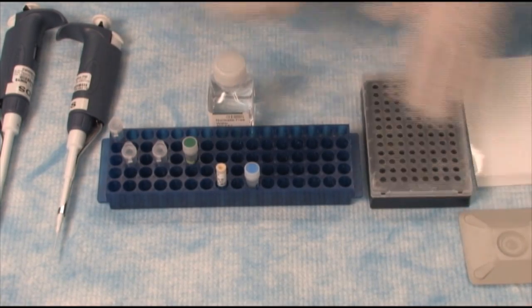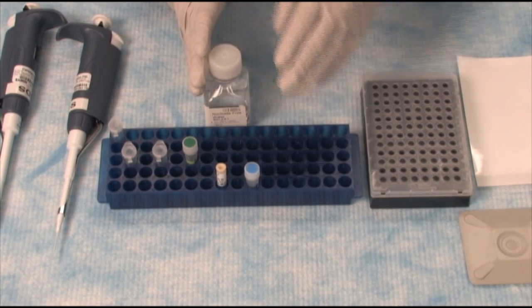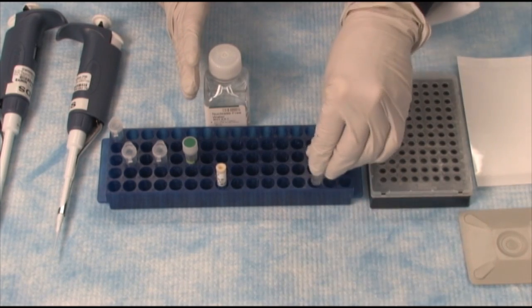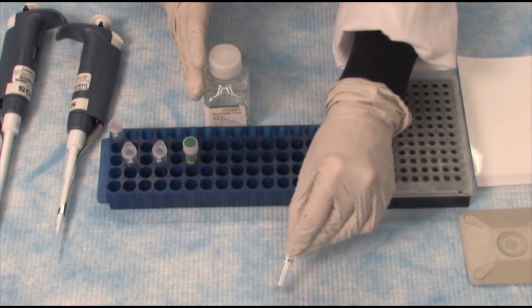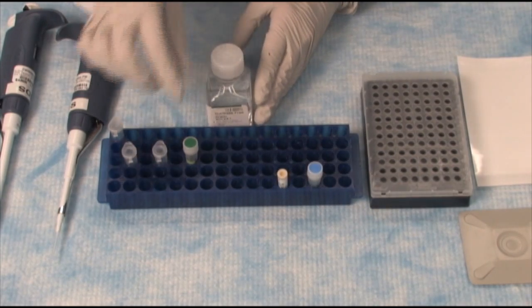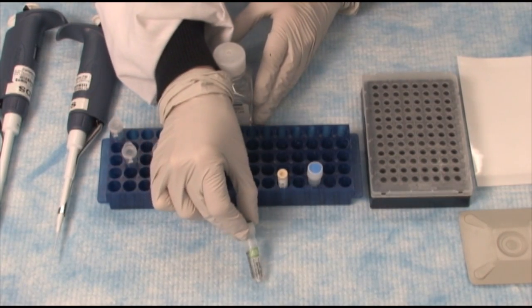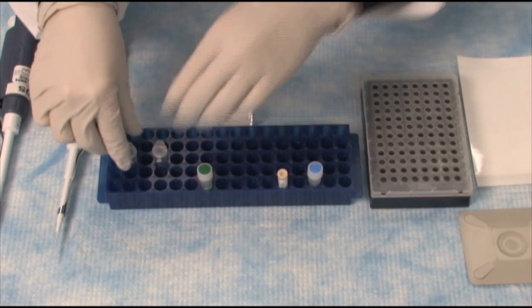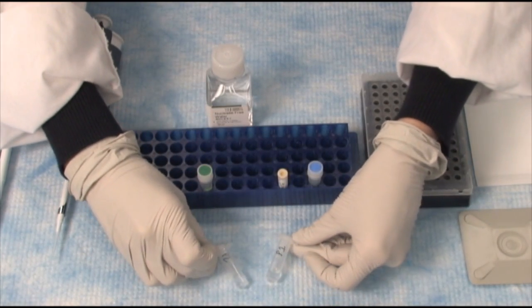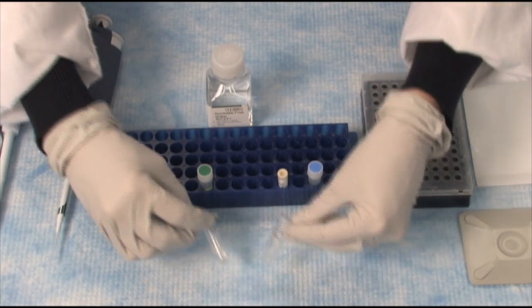In addition, for the reagents, if you're doing a Taqman experiment, you will require the Taqman Fast Advanced Master Mix and a Taqman Gene Expression Assay. SYBR experiments will require the SYBR Green Master Mix and two primers, which I've designated Primer 1 and Primer 2, P1 and P2.